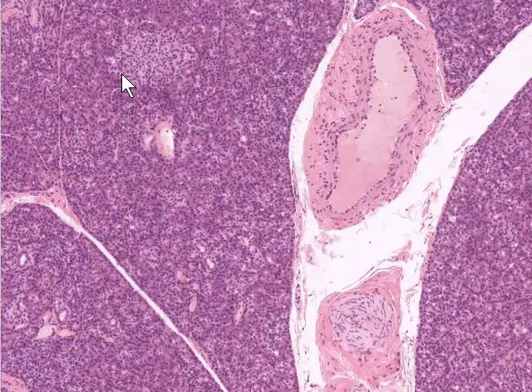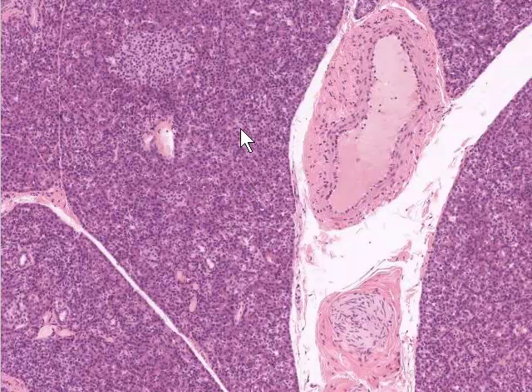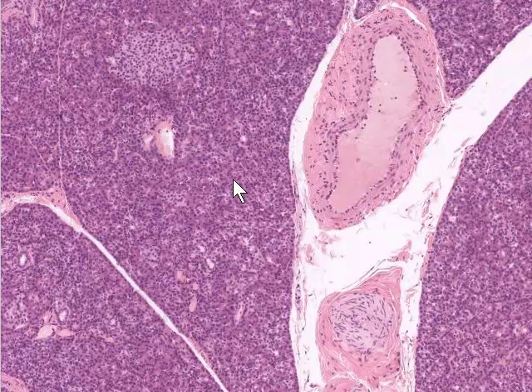Here we have one of these islets of Langerhans, which we'll look at in more detail in a moment. The remaining cellular tissue is largely composed of secretory acini, or clusters of pancreatic acinar cells, which are secreting pancreatic juice containing pancreatic enzymes or pancreatic zymogens. In places we can see small intralobular ducts, and these carry the pancreatic secretions to the larger interlobular ducts.